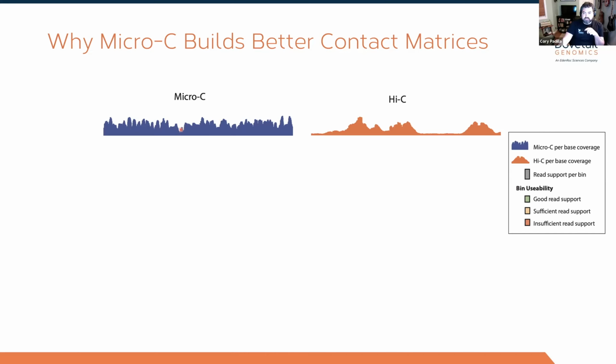You can see some gaps where there is maybe a nucleosome-free region, maybe a different protein is occupying that space. But what you also see in the Hi-C data is, yes, you see those enrichments around restriction sites, but you also see these big gaps, and those gaps occur from restriction enzyme motif deserts. There's no place for that restriction enzyme to go in and cut in these areas.